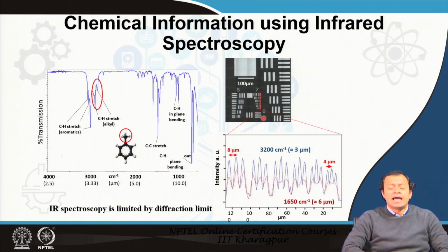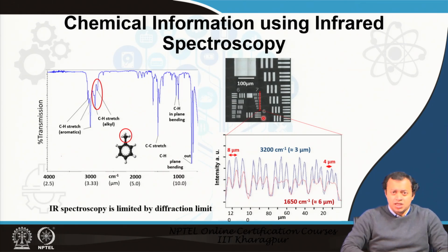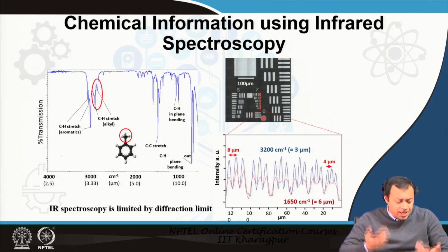What if you have nanostructures which are 50 nanometers? Then you get into the trouble of the diffraction limit. Evanescent field can be used, near field can be used, but near field is weak. The near field actually depends, as a rule of thumb, on the distance between them, and if you have a very turbid medium moving like this, or a very scattering medium like biological material, you are still having difficulty resolving it.